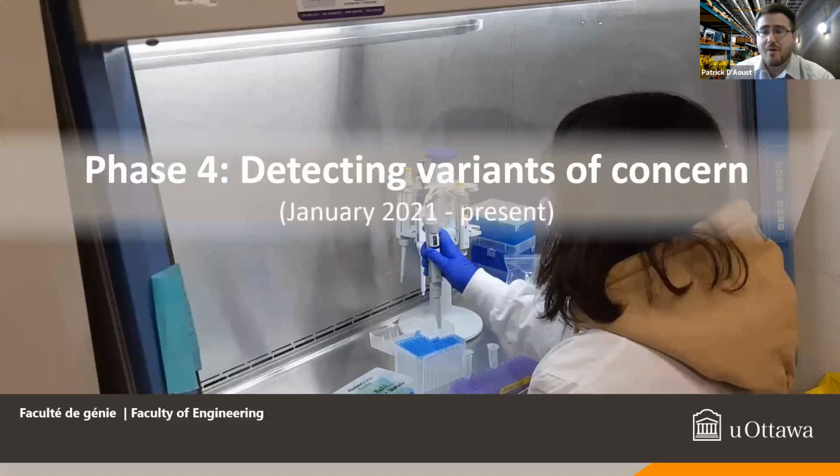So after we got this going, this was basically our daily task, among 13 other sites that we test periodically throughout the week. We started looking at variants of concern. Variants of concern were something that happened in Canada as well, and we were very worried about what they would mean for the wastewater data and for public health. What would happen in terms of the number of deaths and severe SARS-CoV-2 cases.